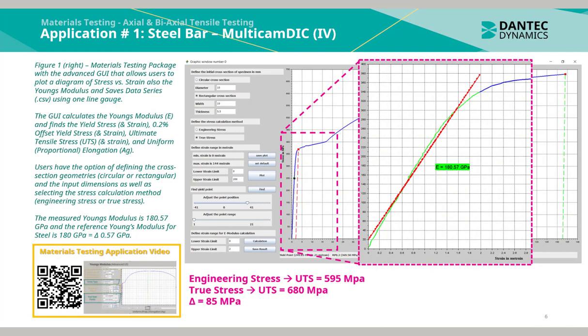In Figure 1 to the right, we see the materials testing package with the advanced graphical user interface that allows users to plot a diagram of stress versus strain, also the Young's modulus, and saves the data series using one line gauge.